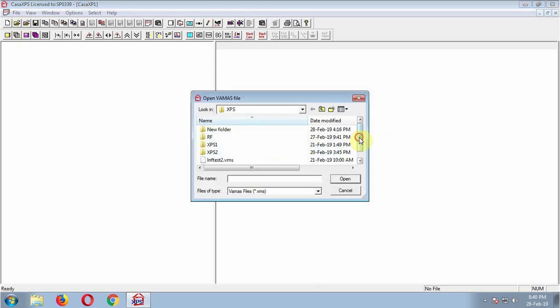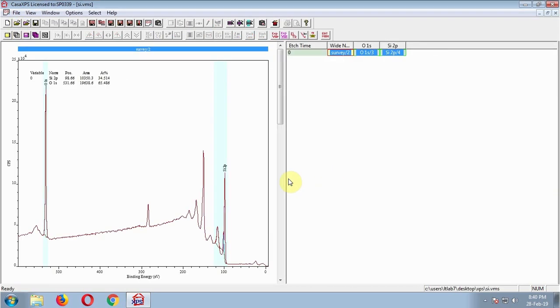I will show in this video how you can improve your XPS peak fitting following a few simple steps. I will use Silicon 2P as an example, but I will show it in a general way so that you can follow these steps for any element.